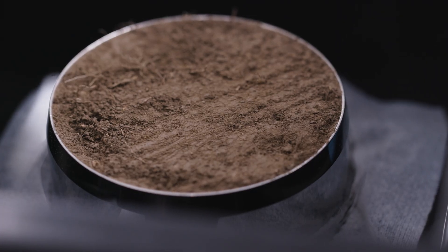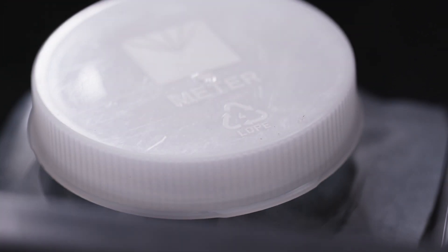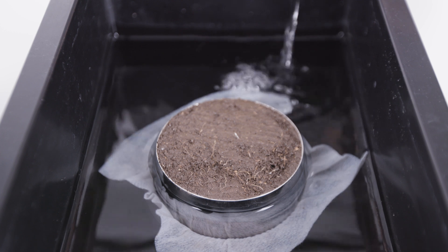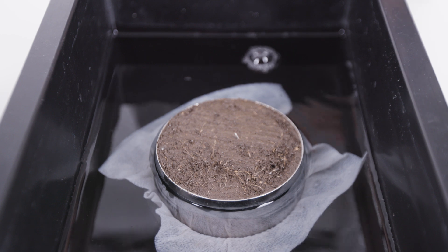For clay samples, place a plastic cap loosely on the sample ring so that air can ventilate. The cap protects the soil from evaporation. Raise the water level to half a centimeter below the sample rim. Don't pour water directly on the sample, as you may trap air.